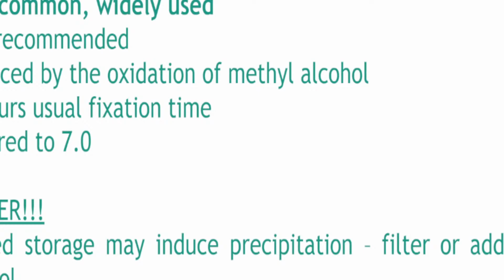Ano yun? Ano yun, sir? Pag prolonged storage kasi may namumuo sa ilalim. 'Di ba? May namumuo sa ilalim. Kaya maglalagay ka ng 10% methanol para ma-oxidize yung namuo sa ilalim. Okay? So bakit sir? Tinanong ba yan sir sa board exam?